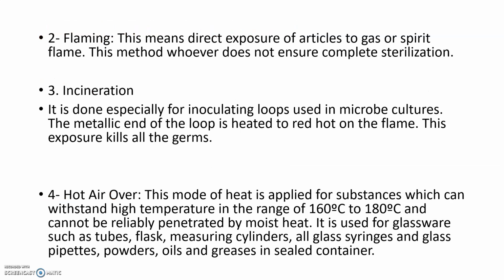The next coming is flaming. So this means direct exposure of articles to gas or spirit flame. And this method, however, does not ensure complete sterilization. That is a disadvantage.